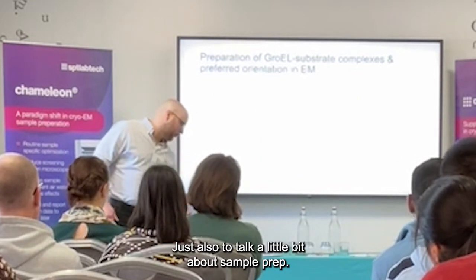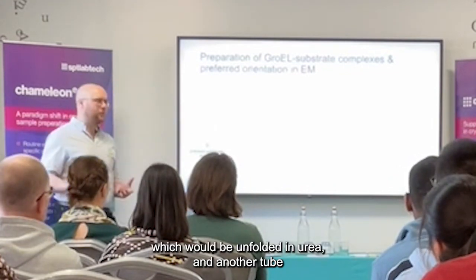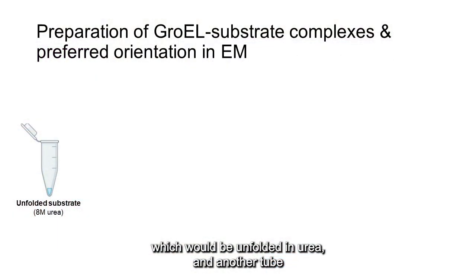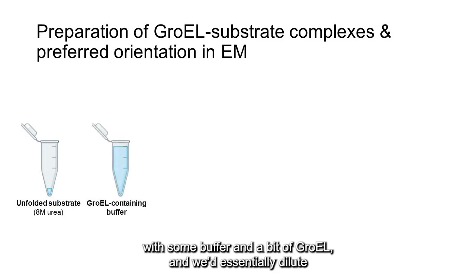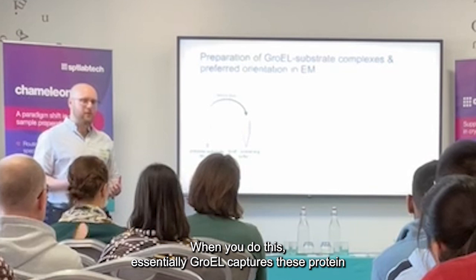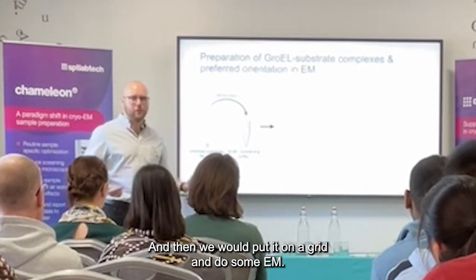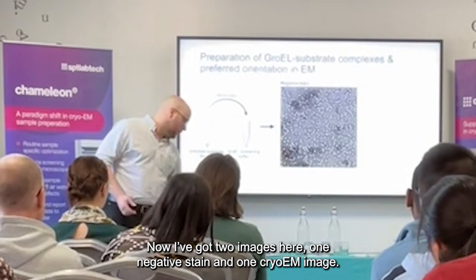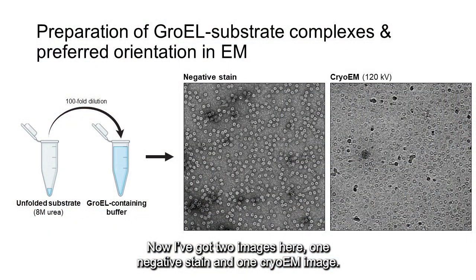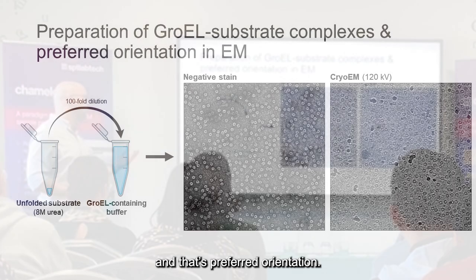Just to talk a little bit about our sample prep: we would start with our protein substrate, which we unfolded in a tube with urea. We'd have another tube with some buffer and a bit of GroEL, and we'd essentially dilute the unfolded substrate into the buffer containing GroEL. When you do this, GroEL captures these proteins and forms complexes. Then we would put it on grids and do some EM. I've got two images here — one negative stain and one cryo-EM image — and if you look closely, you can start to see the problem we've had, and that's preferred orientation.